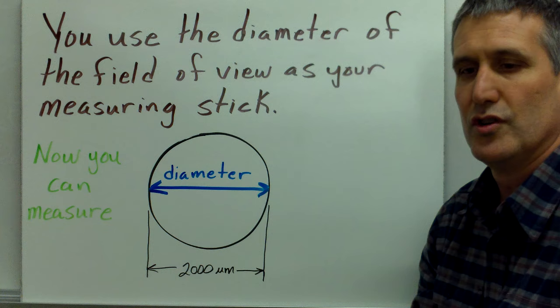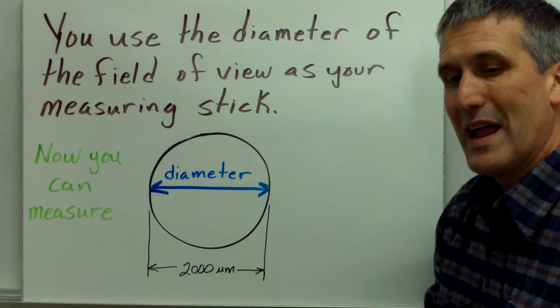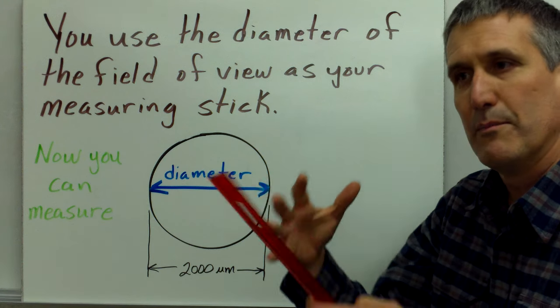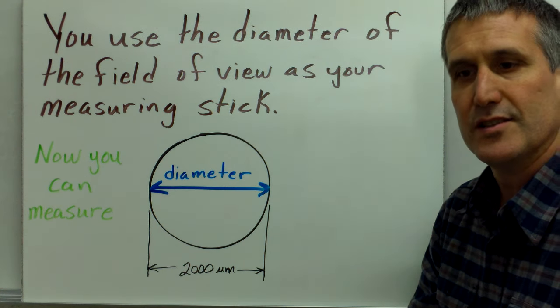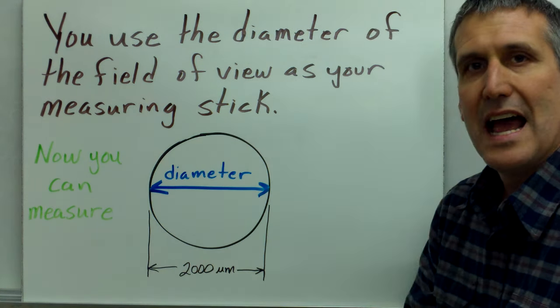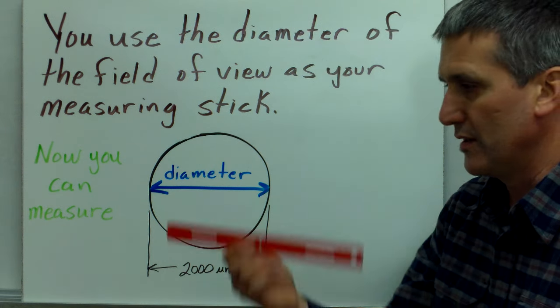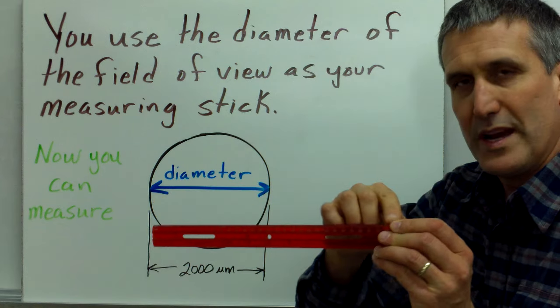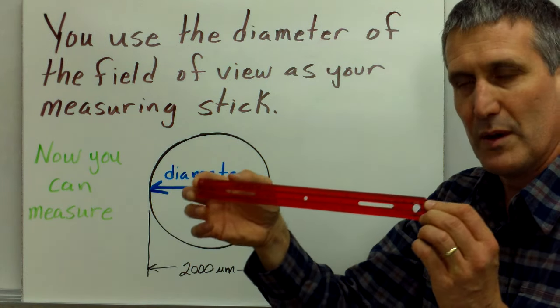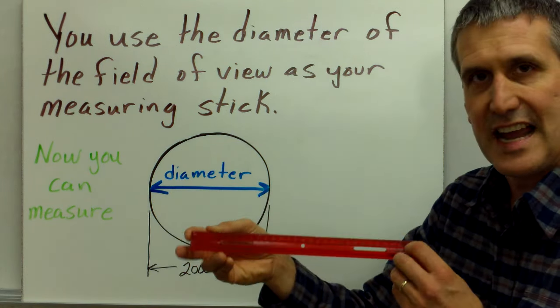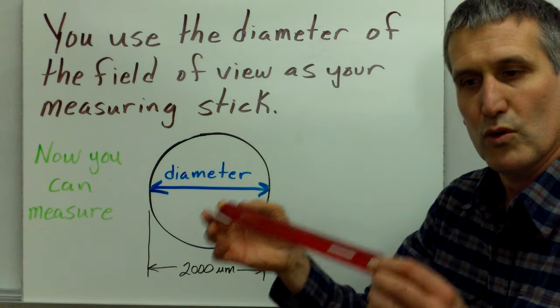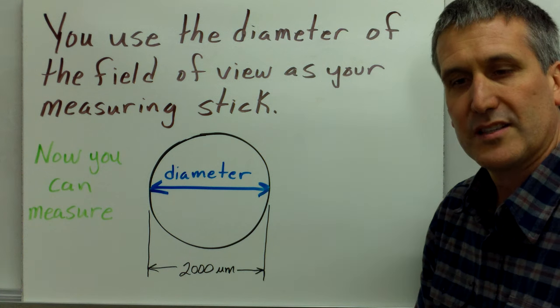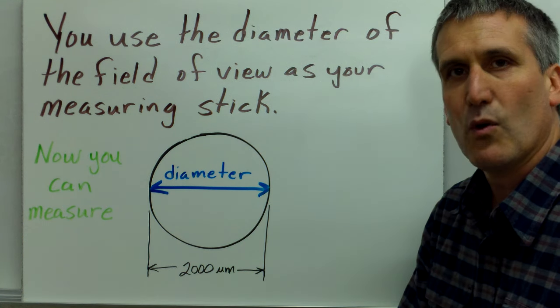So how do you do it? Well you don't have to have a ruler to measure something as long as you know how big something else is. You can use that as a thing to measure with, because a ruler is basically just something that we know the size of, or we have actually set up this as a standard. We know that the ruler is a certain length and we use it to compare other objects to it, and then we can make a quantitative observation or measurement.